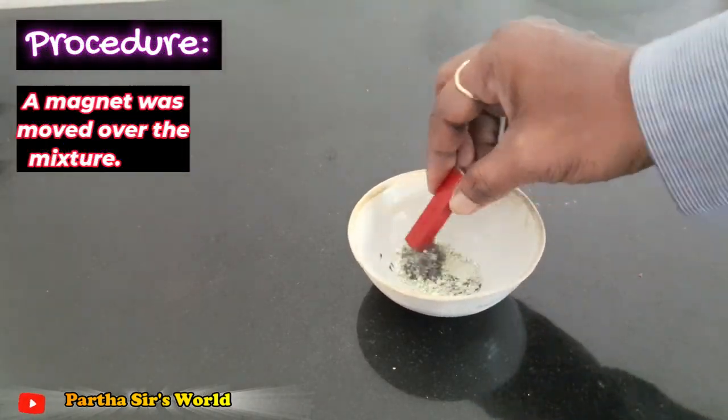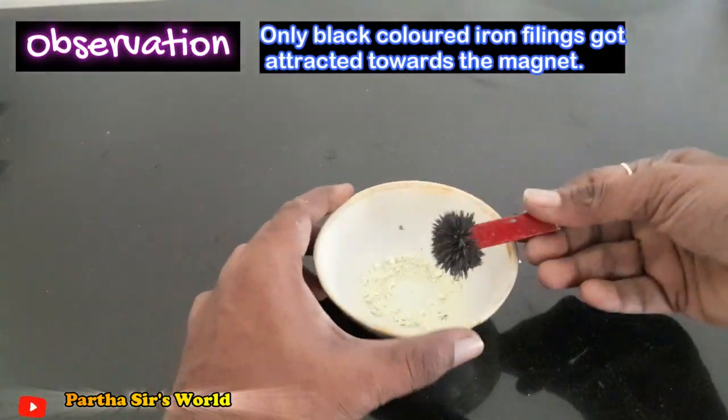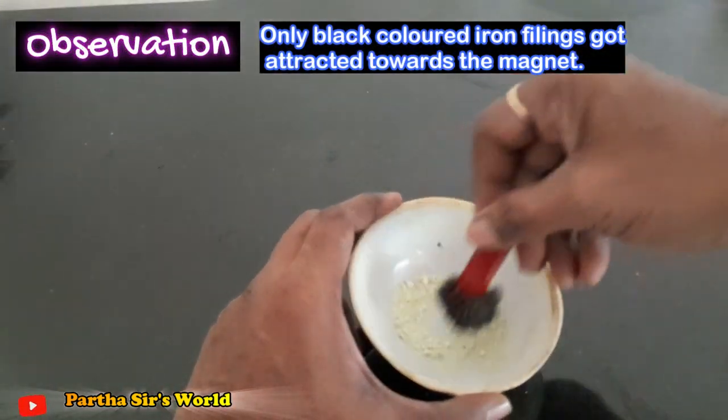Procedure: a magnet was moved over the mixture. Observation: only black colored iron filings got attracted towards the magnet.